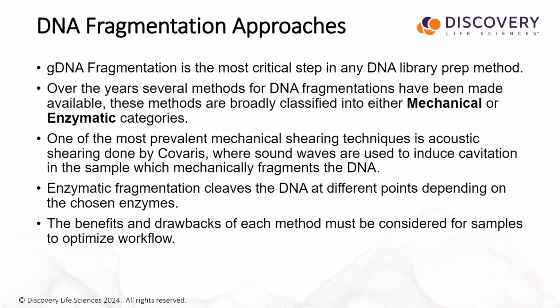Enzymatic fragmentation uses different enzymes, depends upon which vendor you're talking about, and they are going to cleave the DNA at different points depending upon what the chosen chemistry of that enzyme is. These methods both have some benefits and I would rather not say drawbacks, but some things to consider for the downstream workflow optimization.